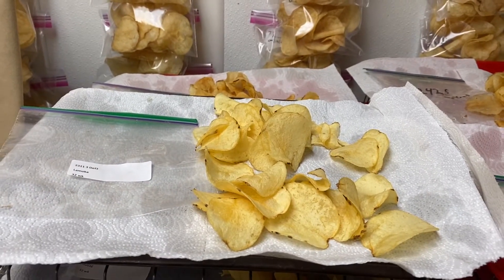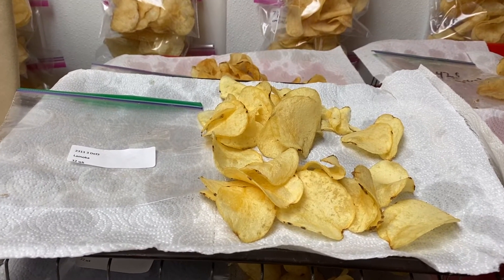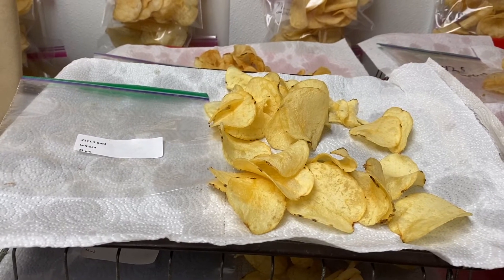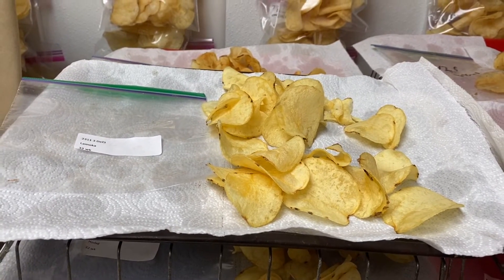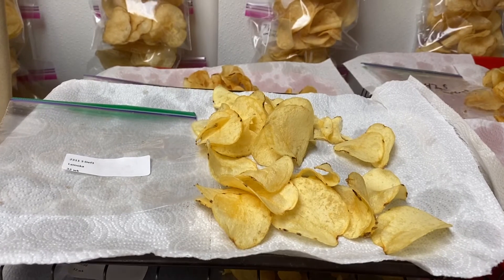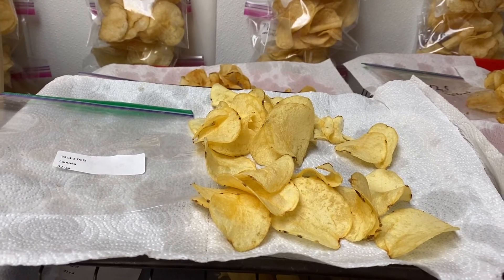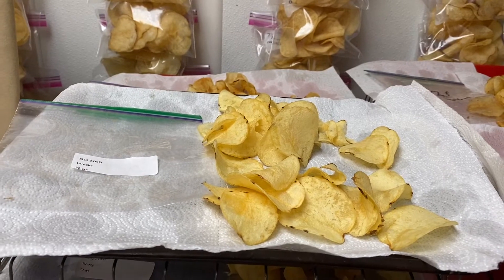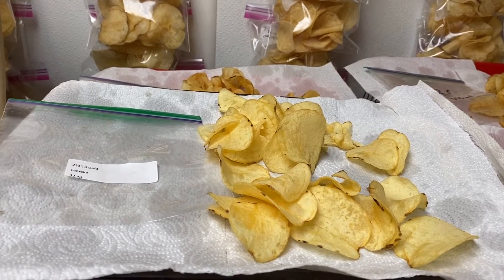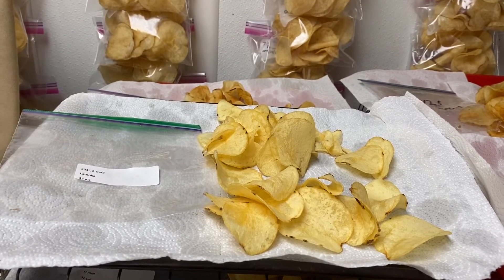These are the potato chips after frying. What we are evaluating here is the fry color of each chip. During storage, if quality is maintained at a good level, we should have low sucrose and low glucose content. When frying in oil, glucose typically reacts with amino acids in the tuber, and the end products will be some pigments. We don't want those pigments because they make the chips look dark. So the objective of storage is to maintain glucose content as low as possible.